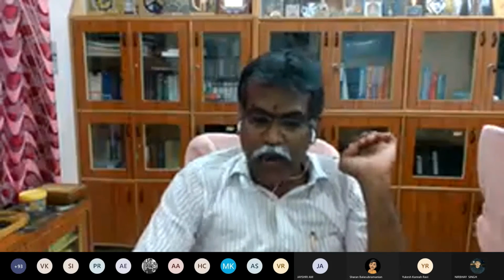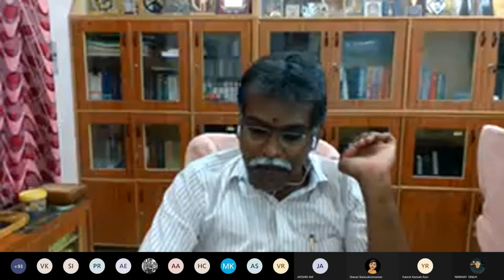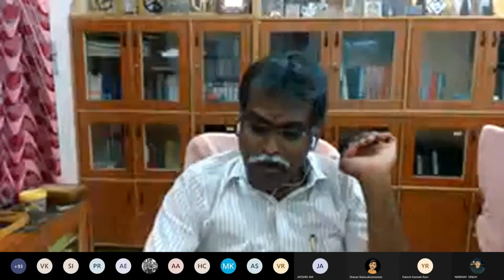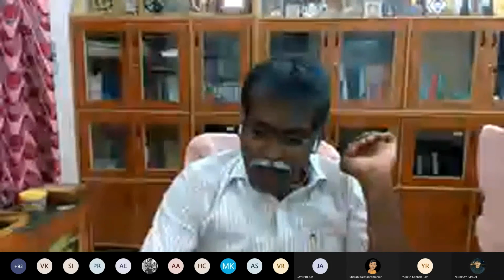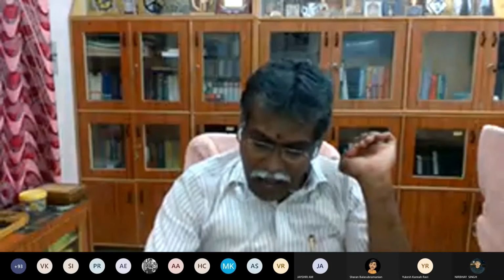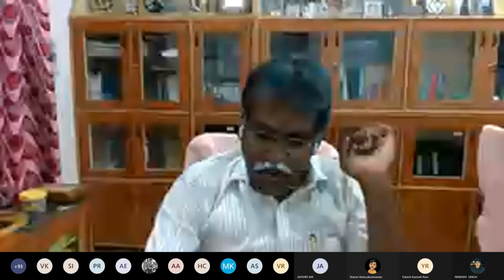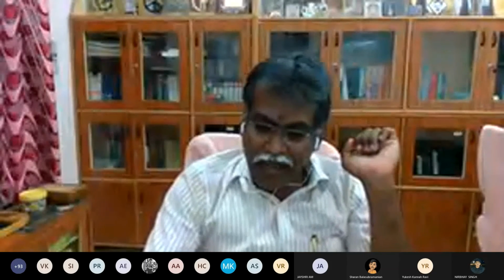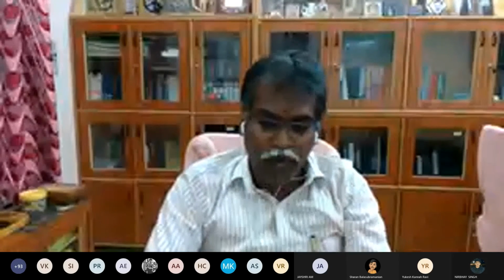These are standard cuvette bottles. Please make a note. These are cuvette bottles, and you can see the mark. You have to fill the sample only up to this mark. You can also see a black colored lid. You can remove it, place the bottle inside, and close the sample with this black box again. That means you should not allow external light to hinder your measurement. That is important. Please make a note. This is by either photometry or nephelometry, and external light should not disturb your turbidity measurements.